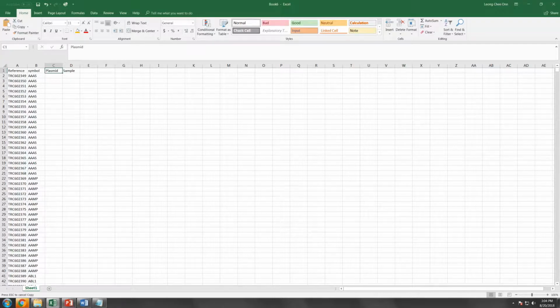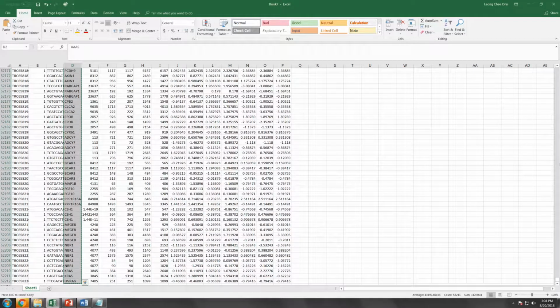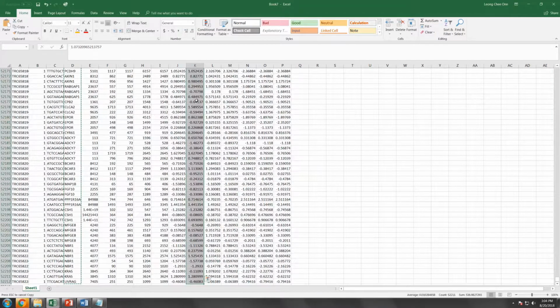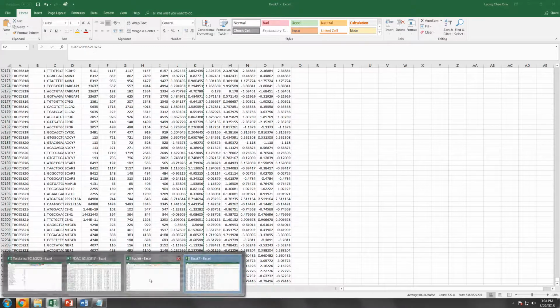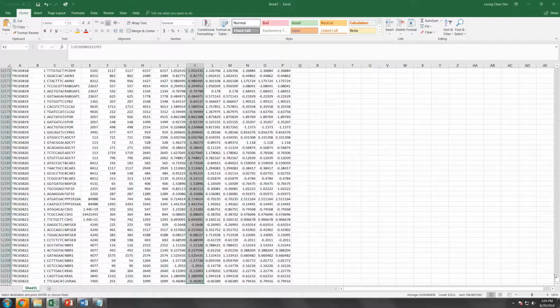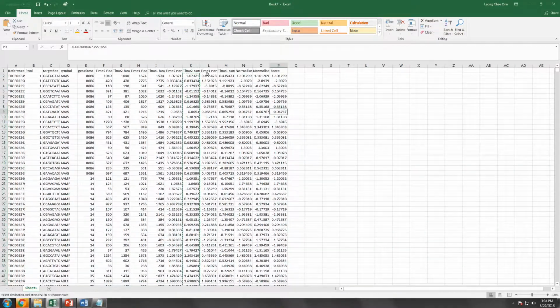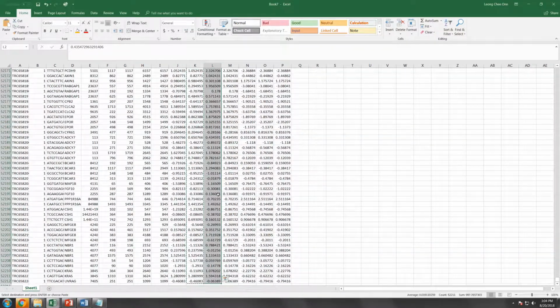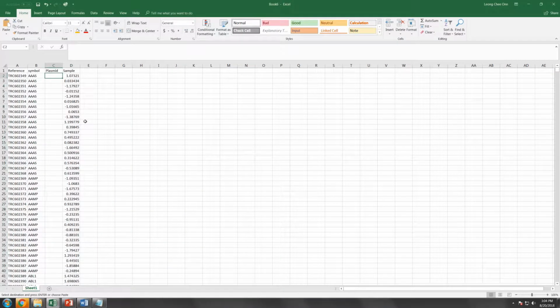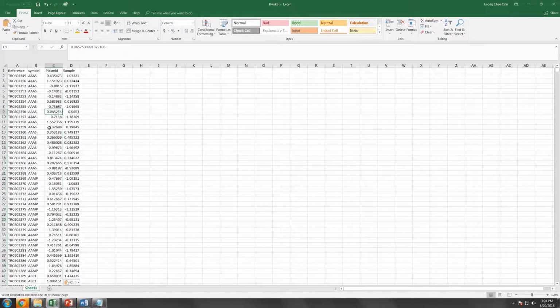Now, remember, don't mix up here. This is the critical part, because time2 is your sample data, so it will be input here, and time1 is your plasmid data. If you swap them, your data will come up directly opposite. Okay, here you go. So you have the first input file for the RIGER.